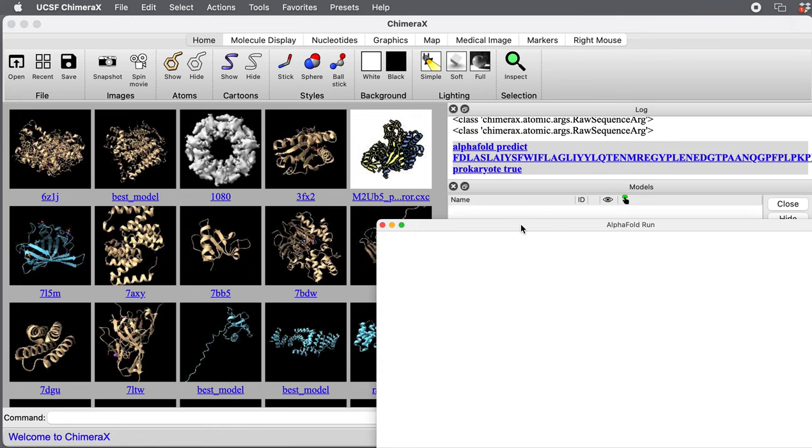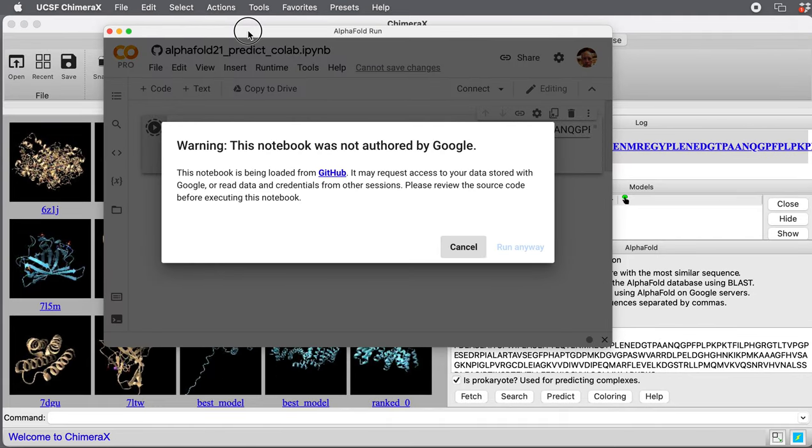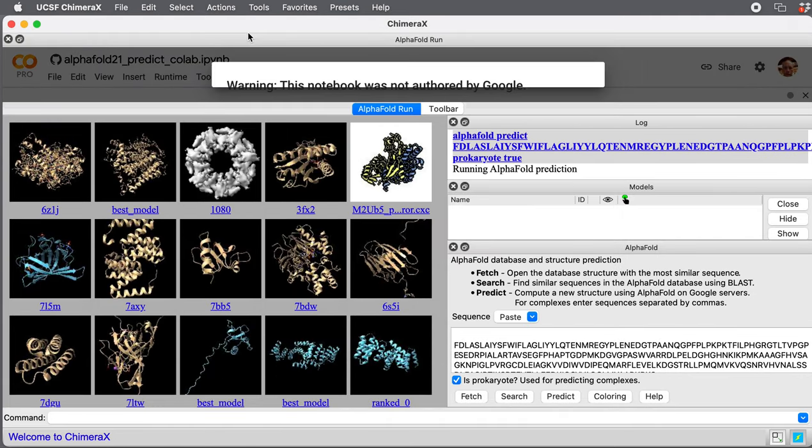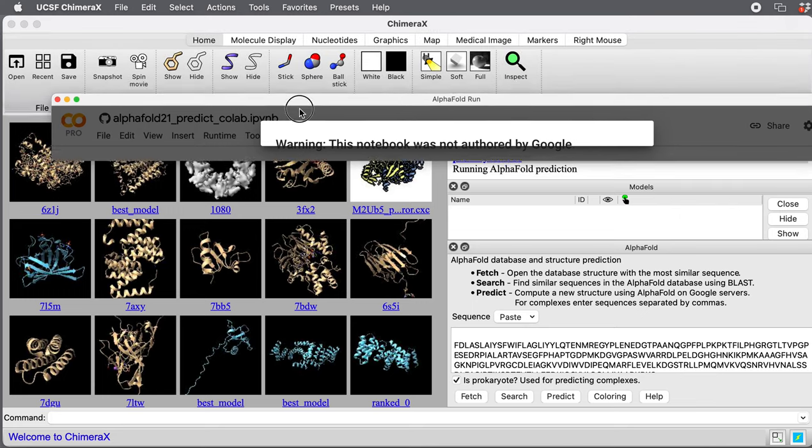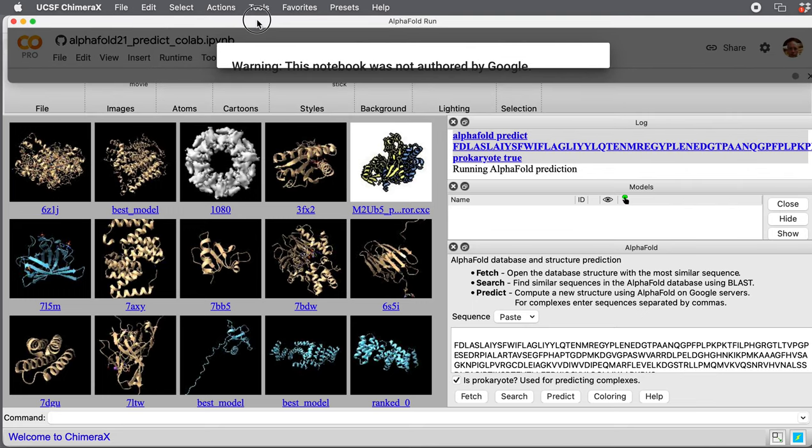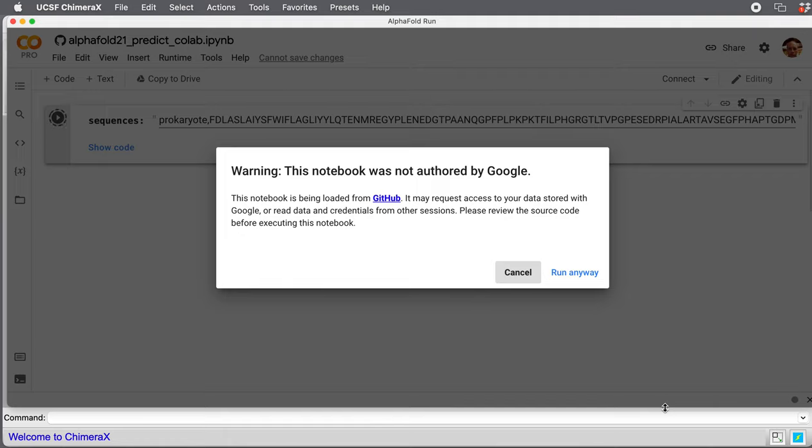This panel will come up, which is just a web browser panel. When you do this for the first time, instead of seeing this little dialogue popping up, Google is going to ask you to log in.